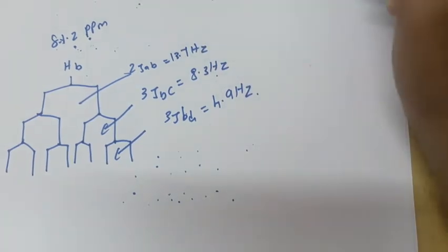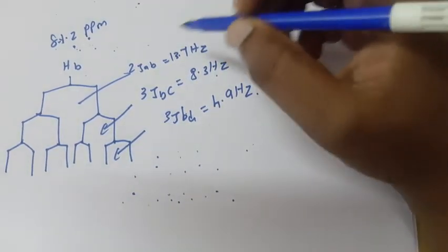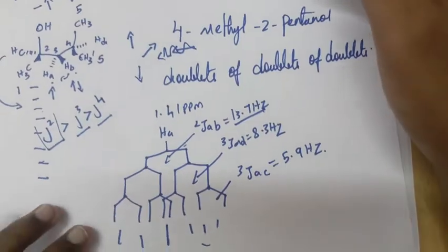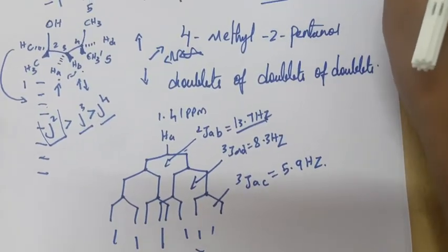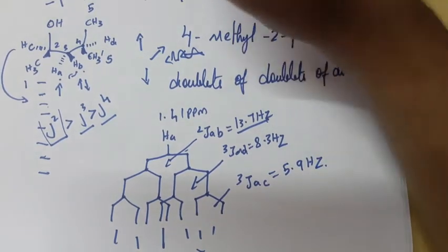We have 3 non-equivalent protons there too, and that's how it's going to happen.